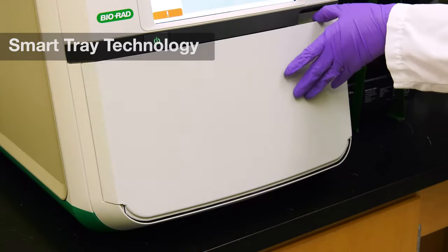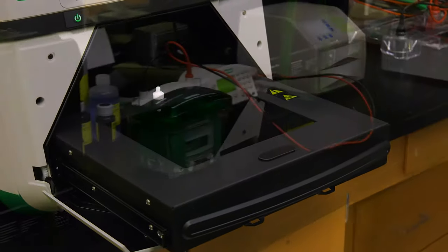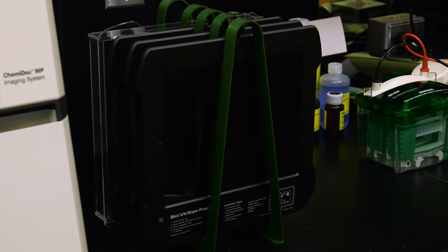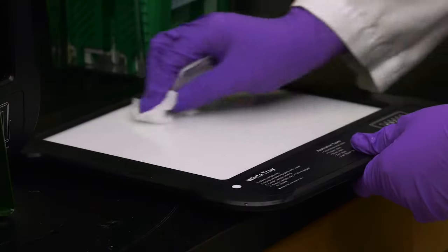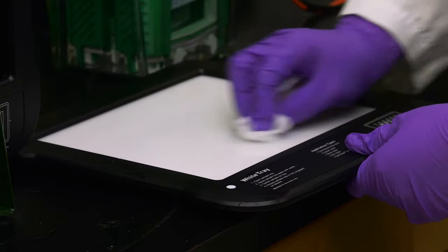To begin, open the imager and pull out the transilluminator. Remember that all gels and blots are always imaged on one of three trays. It is easy but important to clean the trays. Simply use DI water and a Kim wipe for the best performance.